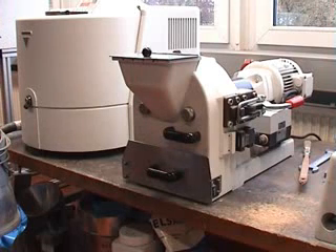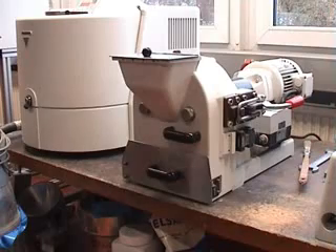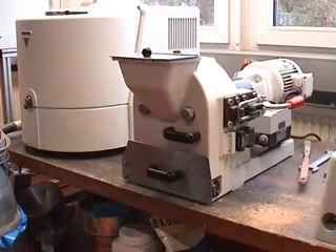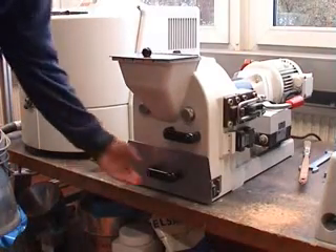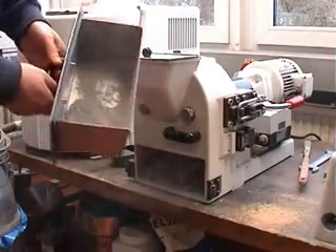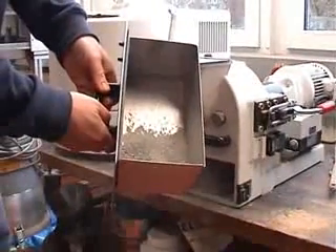You will hear when everything has passed through the mill. And you see — after five seconds, ten seconds, this material was already ground. Now you can stop the mill again, and by opening the vessel you see the fineness of the material.